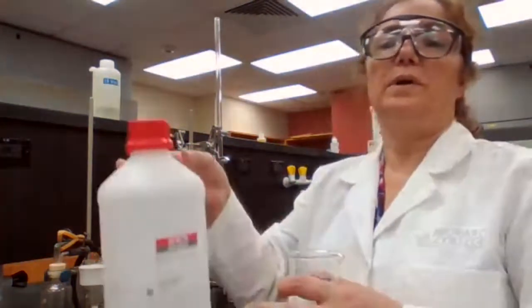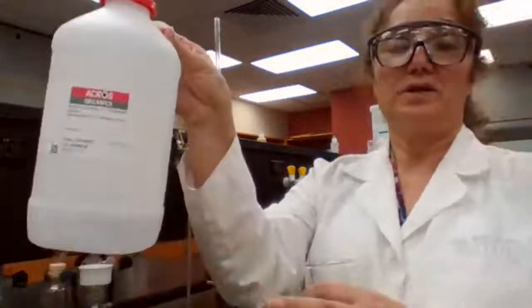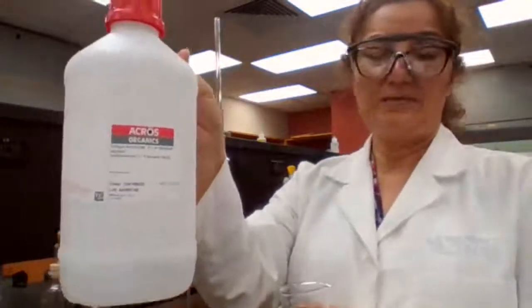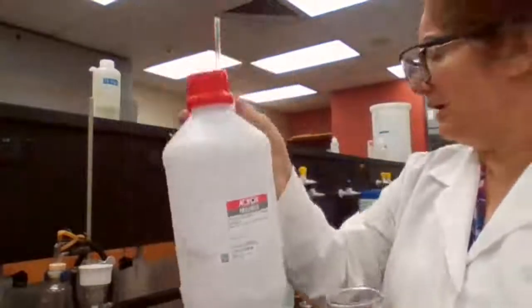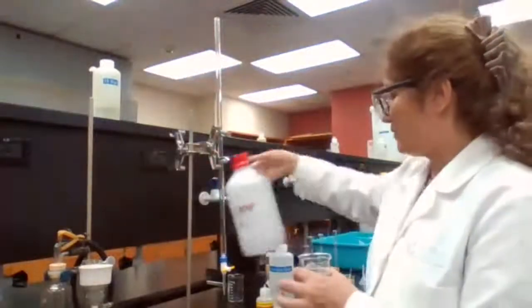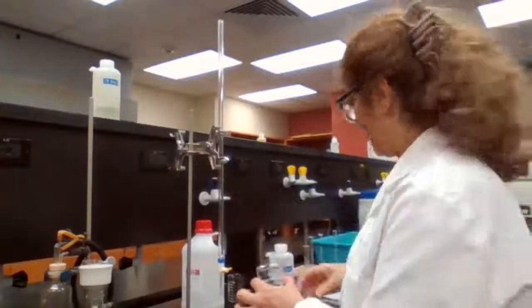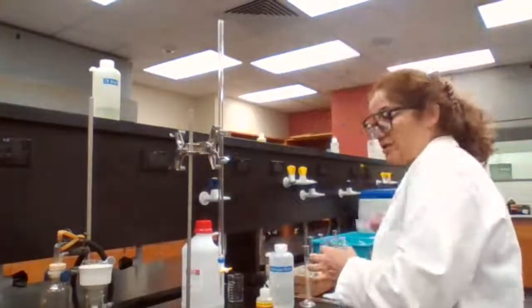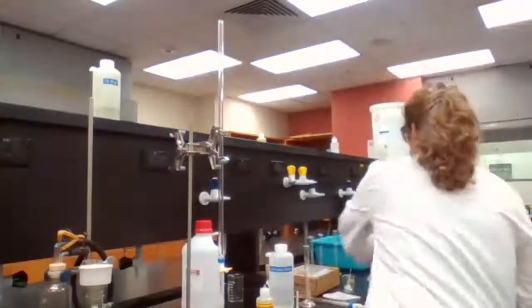With 0.1 molar sodium hydroxide. This sodium hydroxide is not the sodium hydroxide we make here. We actually buy the standard for this titration to make sure we don't have to standardize the solution after we make it, so it's more accurate, basically.